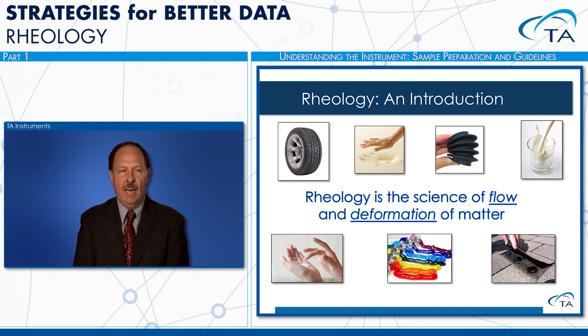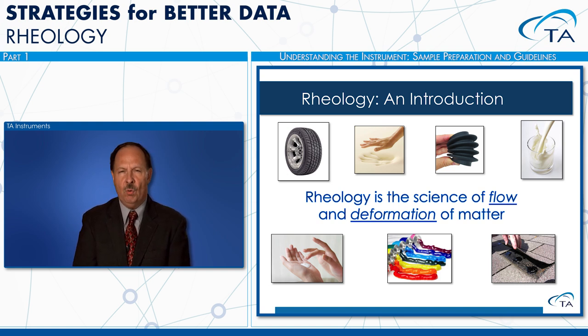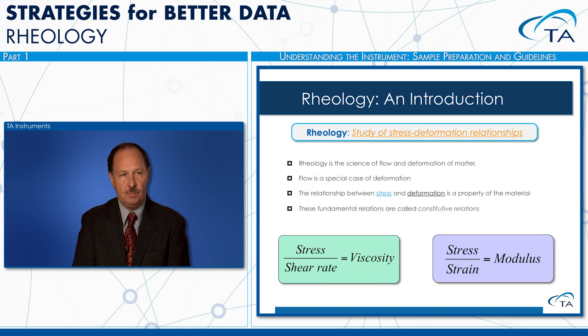of rheology. Rheology is the science of the flow and deformation of matter. And as this slide shows, there is such a wide variety of materials that are run on our rheometers. Materials like automotive tires, foams, various elastomers, milk, dairy products, hand creams, just a number of things, so that for us rheology application scientists, no two days are ever the same, because rheology is such a wide and encompassing field.